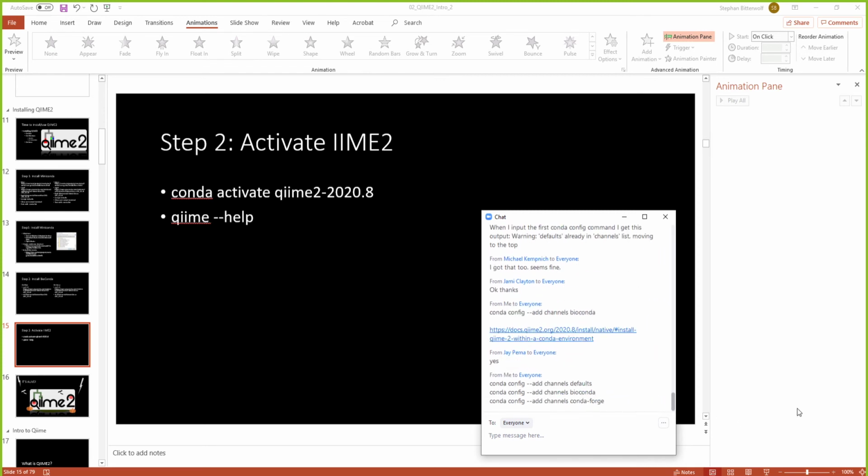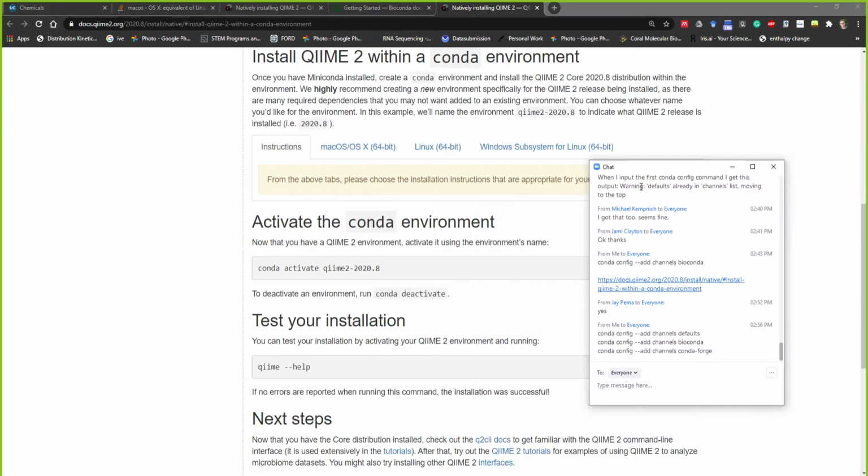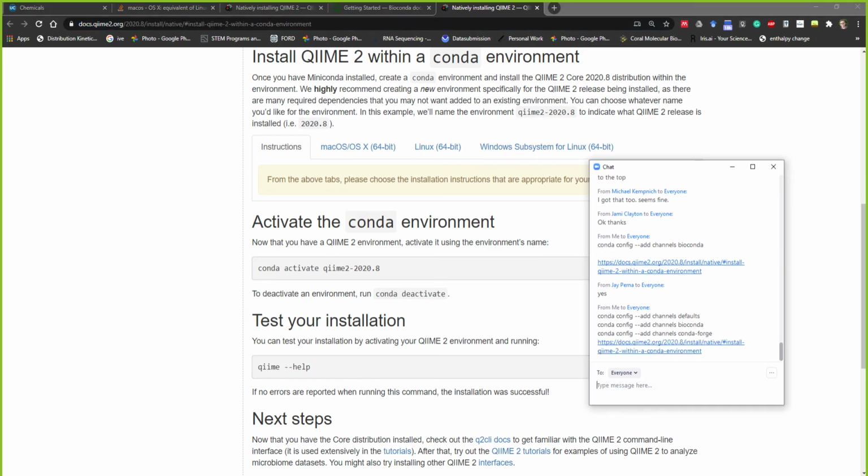Lauren and Johanna, your next step is going to be actually to download QIIME2. So I'll copy this code in there. Did you already do that? Yeah, I copied and pasted it into the terminal, but the terminal says like SPEC not found, invalid name.